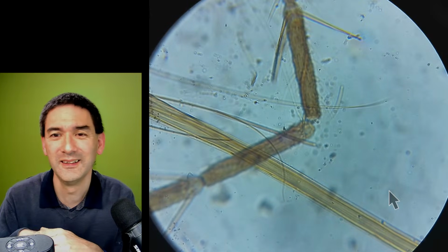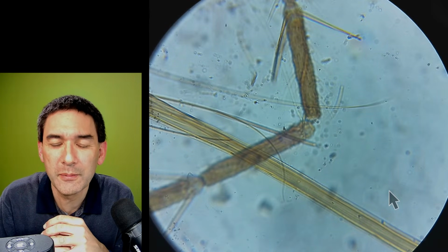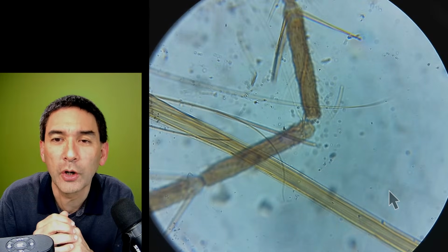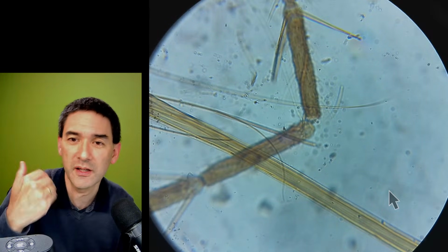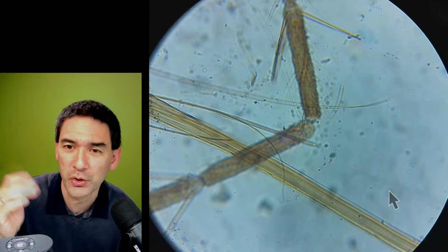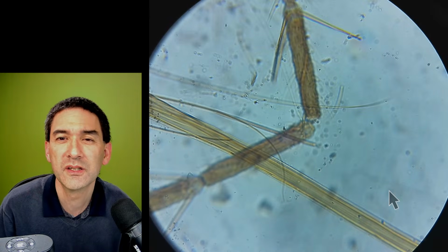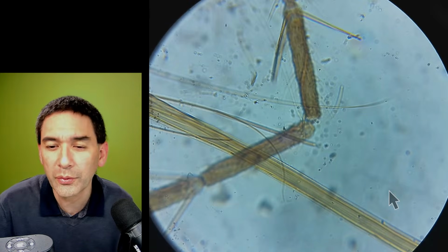Okay. So the cartridge becomes frosty within about 5 to 10 seconds. It's a special grip handle, so it doesn't. Well, okay, I don't mind if the cartridge becomes cold. As long as it doesn't cause any icing on the optical surfaces, I think that should be fine. So what I'm going to do now is quickly go through a couple of the questions that you might have.